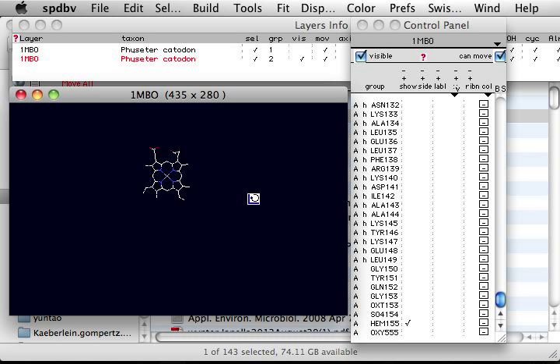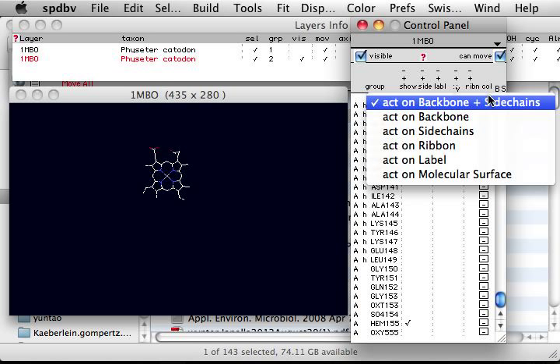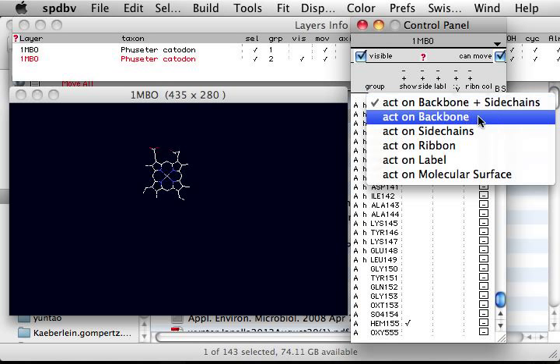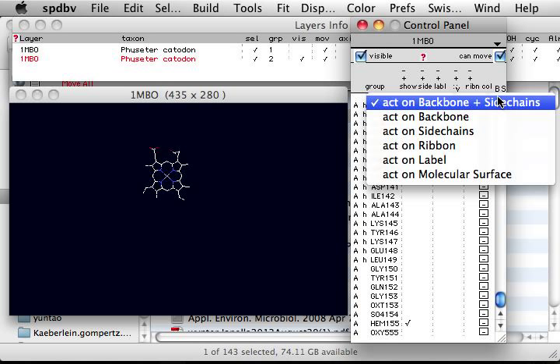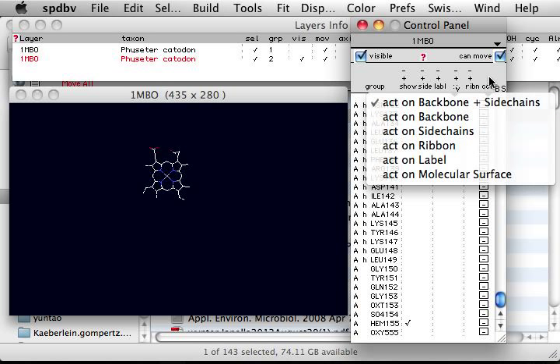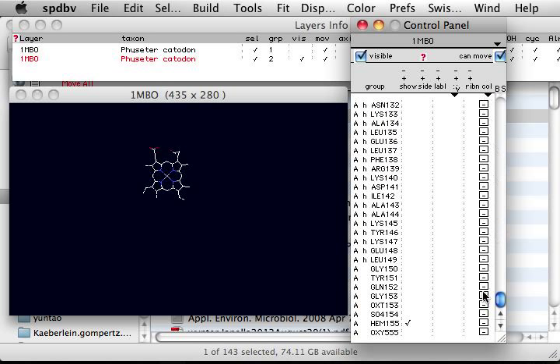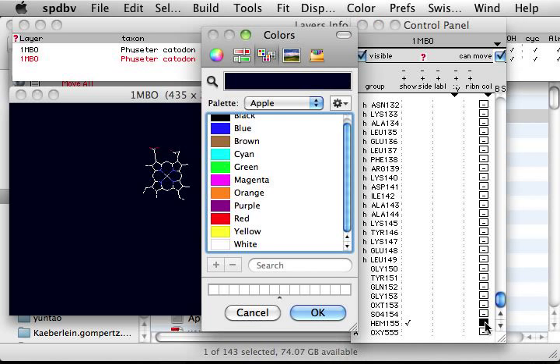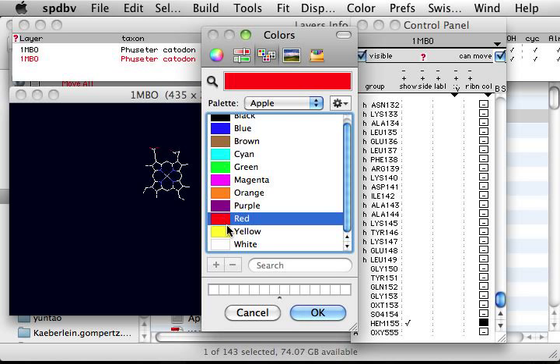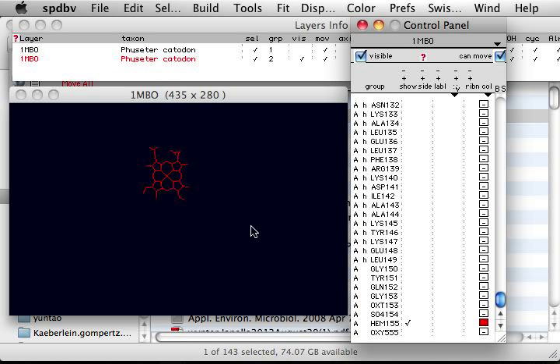In most textbooks, this heme structure is shown in color red. Click color for the heme structure. We select red.